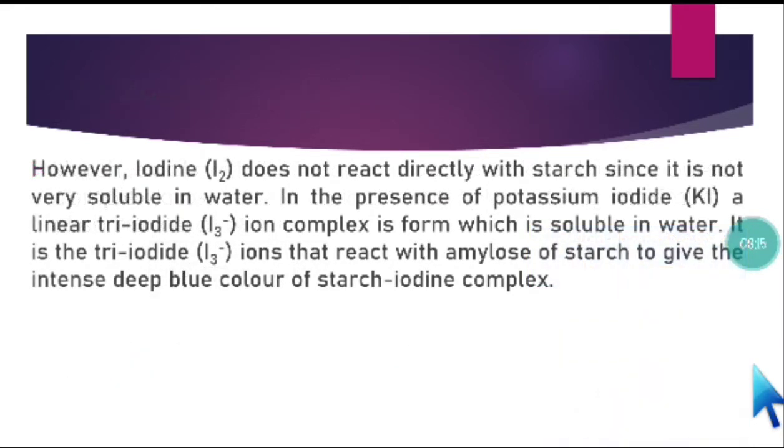So I already explained that iodine does not react directly. Why? Because it is not very soluble in water. In the presence of potassium iodide, you can see that a linear triiodide ion complex is formed which is soluble in water, and it is this triiodide ion which will react with the amylose of starch to give rise to a starch iodine complex.